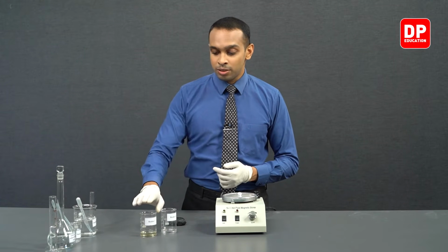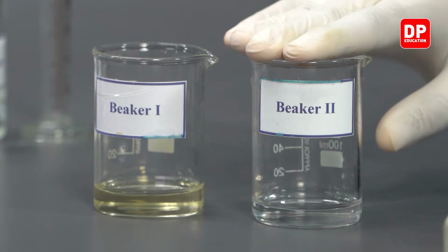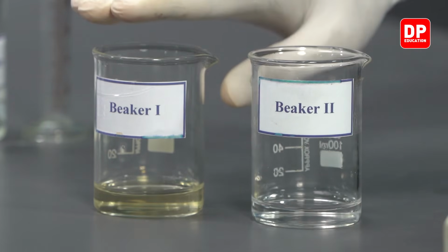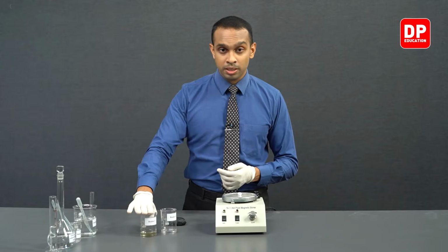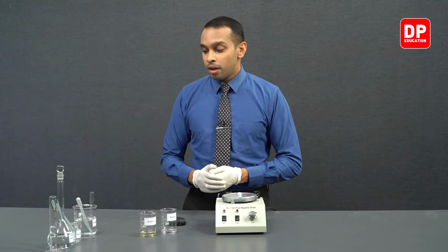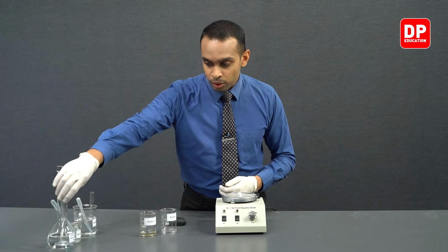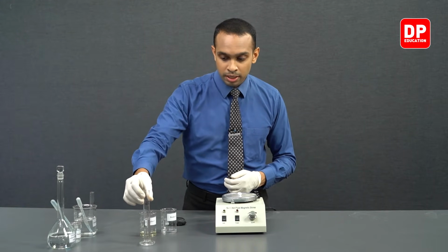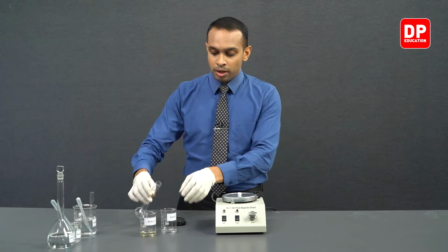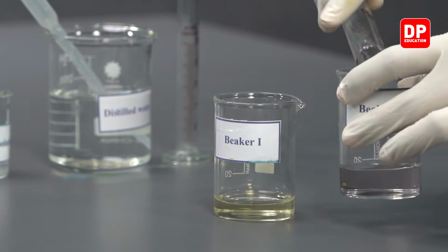So in this case, we have 15 cubic centimeters of Fe3+ and 10 cubic centimeters of potassium iodide measured into beaker 2, and 15 cubic centimeters of Fe3+ aqueous ion solution measured into beaker 1. And we are going to proceed to add our sodium thiosulfate solution. We have already measured it. That's 15 cubic centimeters of sodium thiosulfate. We are going to add it to our beaker 2.